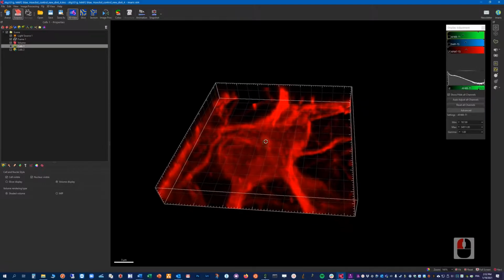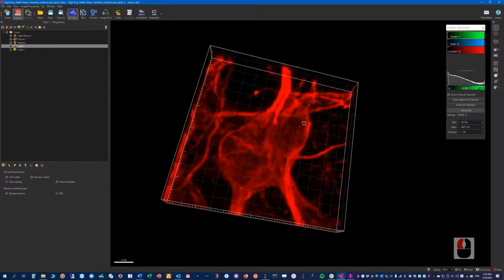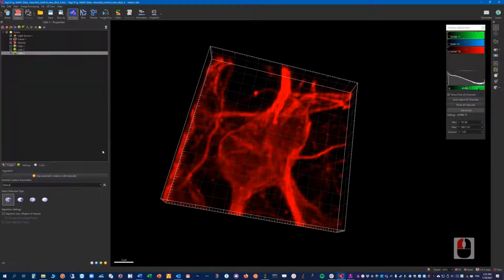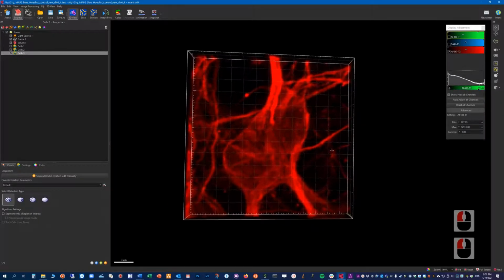Okay, so as you can see here, nothing has changed, but if we now proceed with adding a new cell, we will get much better results. But before we do that, let me just discuss a bit the choice we have to make here.